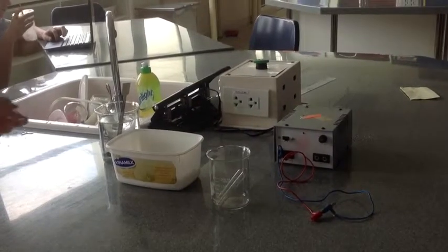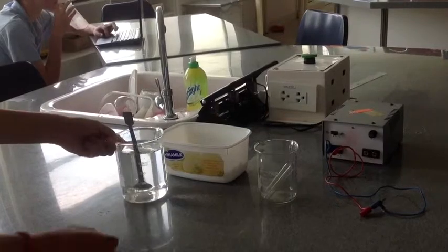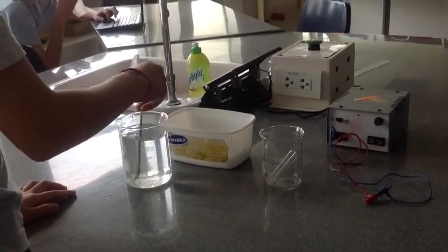First, you'll pour around 300ml of water into the big beaker. Then you dissolve a decent amount of salt into the water.